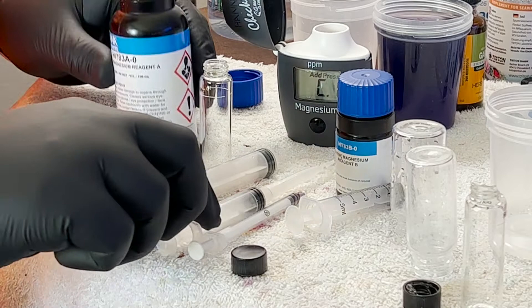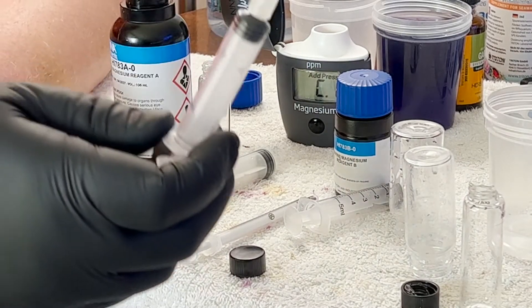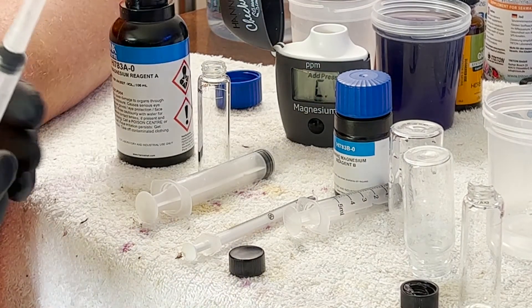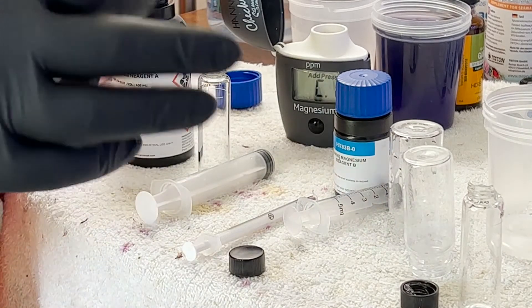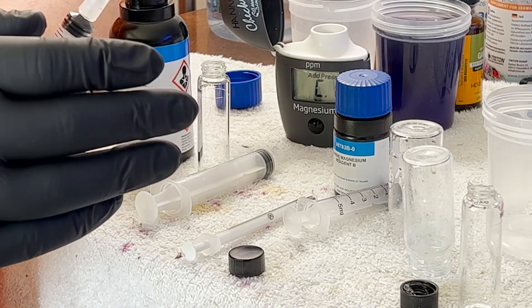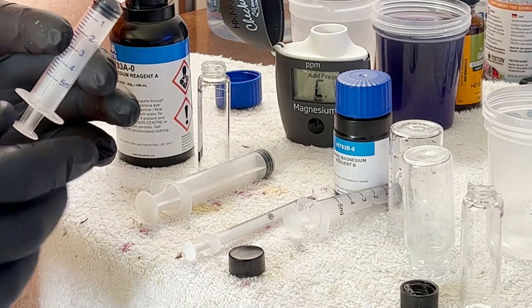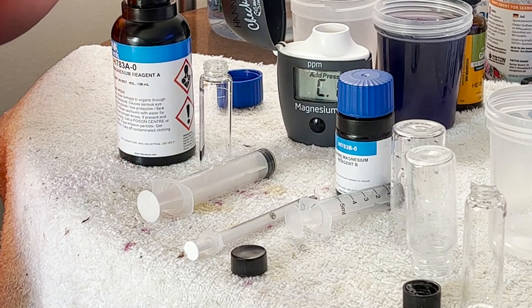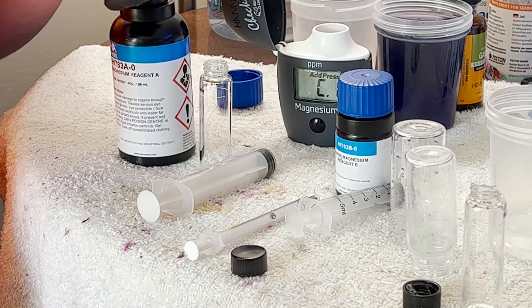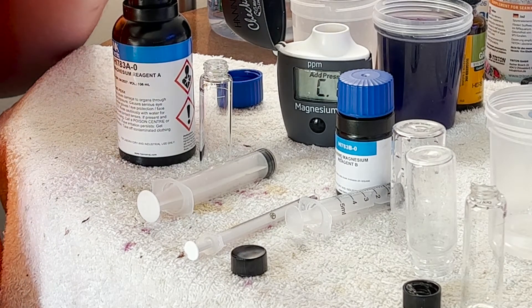It's important that you get one of your five milliliter syringes that has a good seal. I'm going to write them and tell them that none of my syringes and none of the tips hook onto each other, which literally defeats the entire purpose of having this test kit.